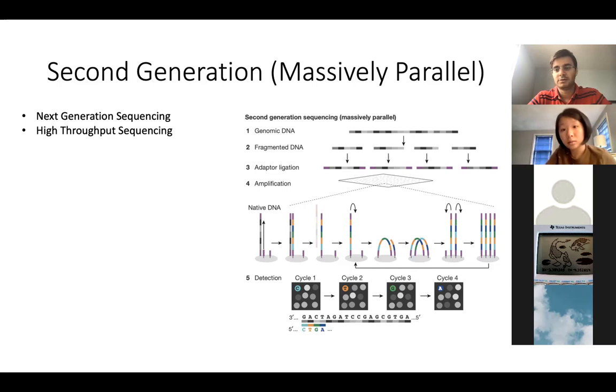I'm trying to see if I understood what you said. Yeah, I agree. Here you have cluster generation. So here, I think the term here is the amount of data. And here we need to introduce this concept of big data. Did you ever hear this concept of big data? Huge amounts of data. You're going to see people talk about the number of reads that are generated in each sequencing run.